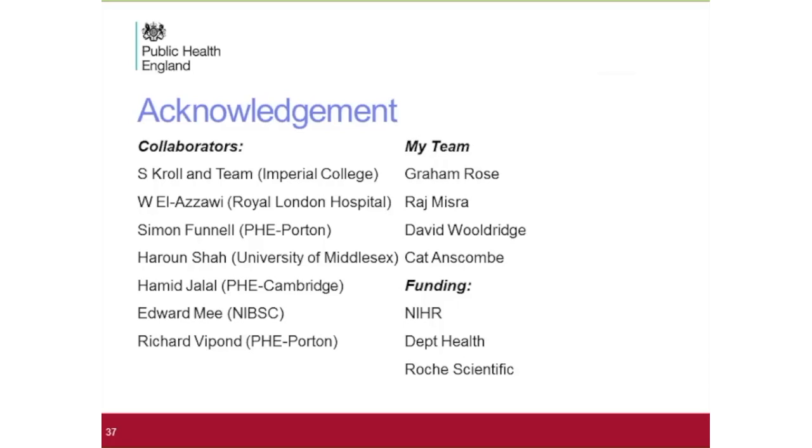Okay. Another one that I had, at one point you said that the enterobacteria were very hard to resolve with doing 16S, but they're very important to the gut microbiome. So, absolutely. 16S gives you an indication on a familial level, and for some of the Enterobacteriaceae to the genus level, but not to the species. And it's only when you undertake shotgun sequence analysis you can resolve them to a more appropriate species allocation.